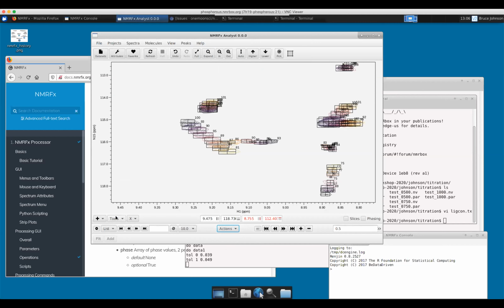Right. So I got this from the tools menu at the bottom of the spectrum window. I went to tools, peak tools. Yep. I've been trying to move almost everything that you would do within a single spectrum or set of spectra into this tools menu, so the interface is similar amongst all the different tools. They all add basically bars below here.